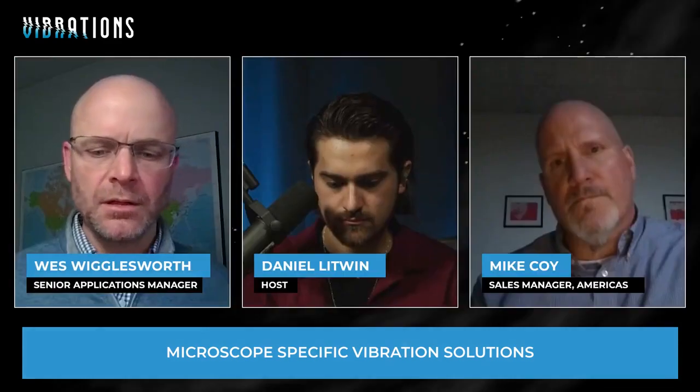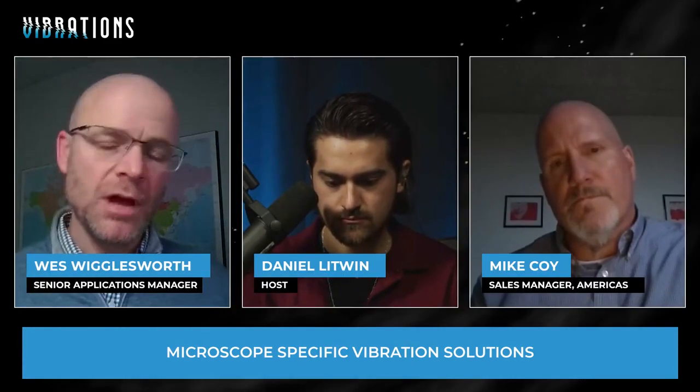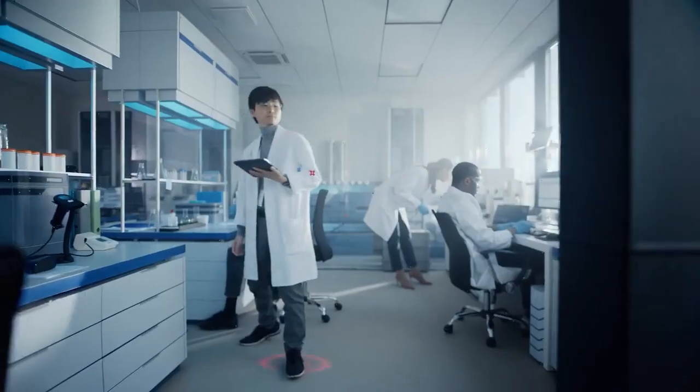Yeah, for sure it's true. Vibration levels do typically get worse over time. When the facility is built, the vibration is the best it can be, really. I would say it's mostly due to traffic in the building, foot traffic mainly, but also street traffic outside and construction that I mentioned earlier.